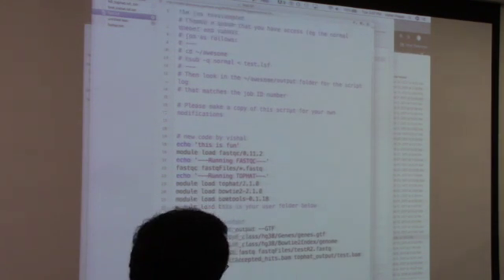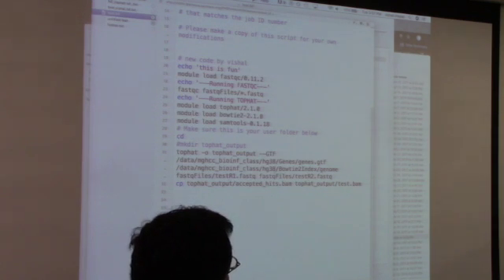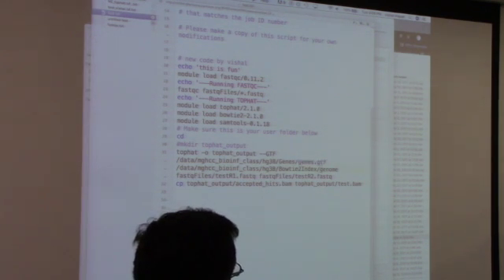Now, here's something that will happen. It should show you this text, but we can't run this as is. Why is that? Well, there's some data missing. Yeah, because the location of these files contains this data directory which you don't have access to. So here is a classic case of correcting your path. Essentially you need the genes.gtf file, you need the bowtie index genome file, and you need these test files.